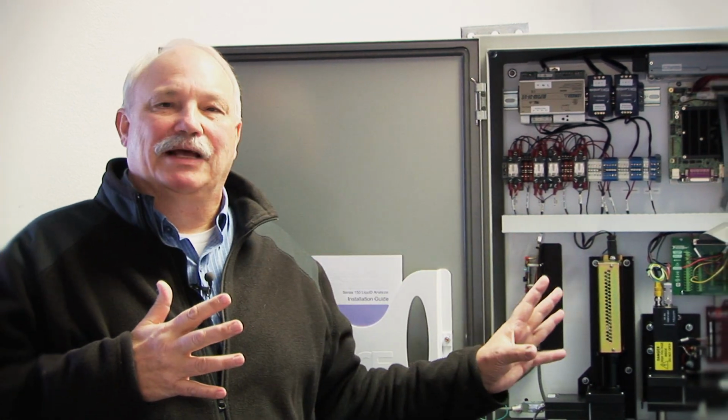So this is why we have to come up with a better technique, and this is why we came up with this methodology. This methodology allows you to make the measurement continually, so you can look at the chemistry that's going on now. So you can adjust your process using this view of the chemistry and make your process better. That's the whole idea here.